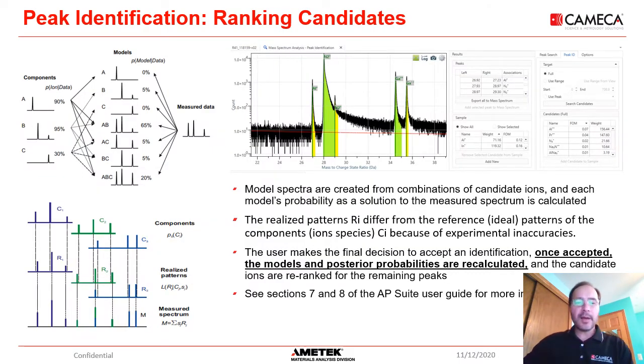There is a lot of matrix math involved, and we won't cover that here. I'm not sure I could cover the math properly anywhere, but using a Bayesian statistical method, possible components are turned into models and are compared to the measured data, and a complex scoring method is then used to rank the possibilities. The user then chooses the peaks that make sense using the algorithm suggestions and their own knowledge of the specimen they're analyzing. The search can be applied to the entire mass spectrum or just the window you're viewing in the event you're just tracking down some pesky unknowns.